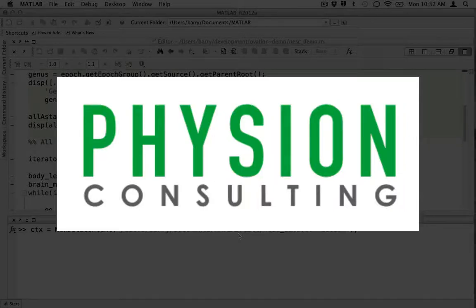Ovation is a revolutionary tool for managing research data. Ovation makes it easy to organize, search, and collaborate like never before. Researchers already have enough tools and steps in their workflow. Instead of adding another tool to this overload, we've integrated Ovation directly with the tools that researchers already use.